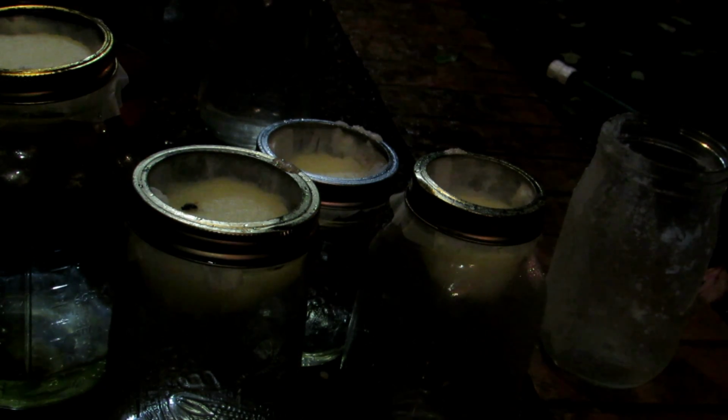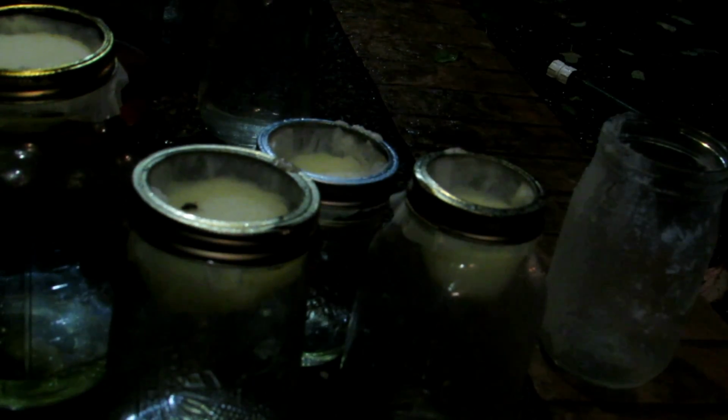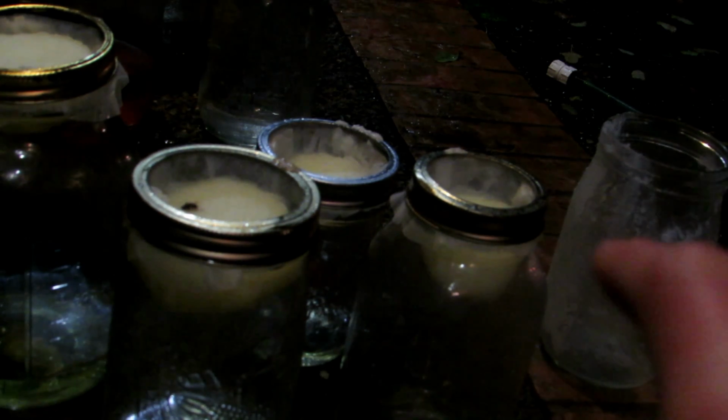Okay, so as you can see, it's been a day and a half or so, and everything's been filtered through fairly well, and you can see this one actually has a dead fly in it, which is kind of interesting. Anyhow, these are extremely acidic solutions here, so we're going to need to wash them. So now that we've gotten rid of most of the hydrochloric acid excess and it's in the bottom, we can take each of these filters containing our silicic acid and put it back into the jar over there.